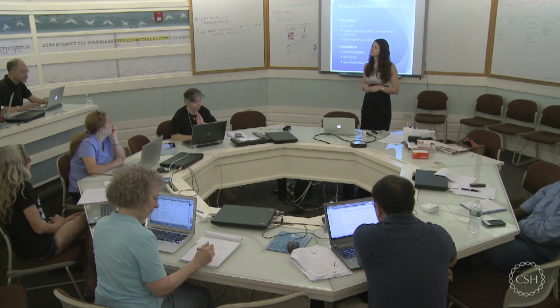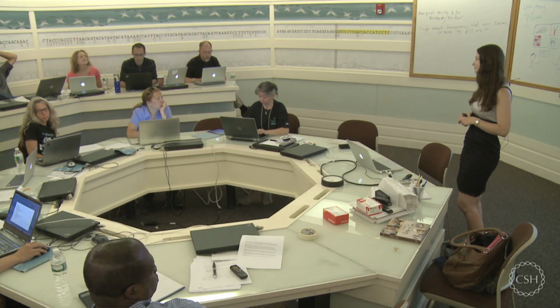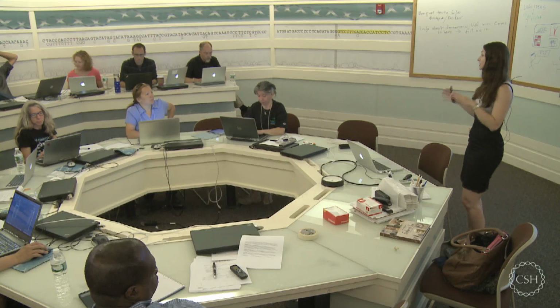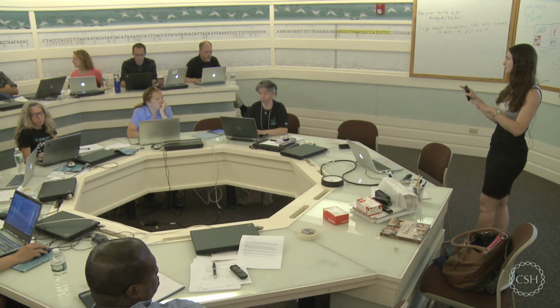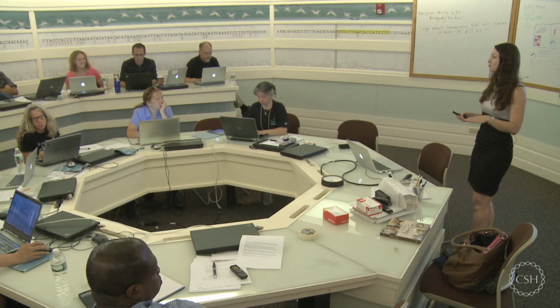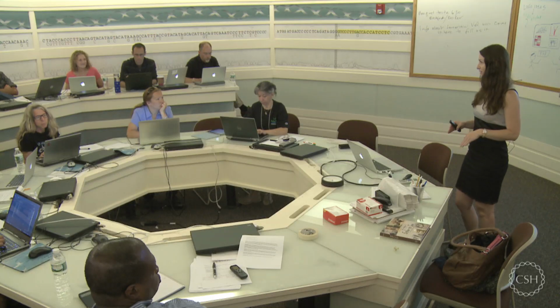And I still don't see why that measure should be more quantitative than the CT values. Oh no, it's not more quantitative than CT values. No, it's more quantitative than RNA-Seq. Oh, okay. Sorry, maybe I said it wrongly. No, of course it's not more quantitative than qPCR. qPCR is the most quantitative method we have. I just wanted to make the point between RNA-Seq and microarrays.